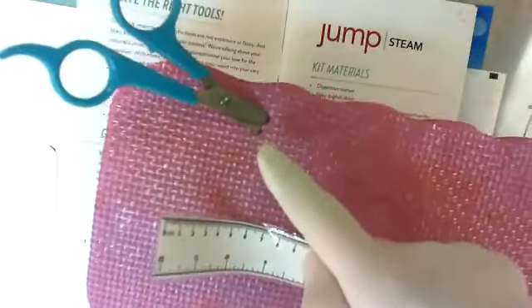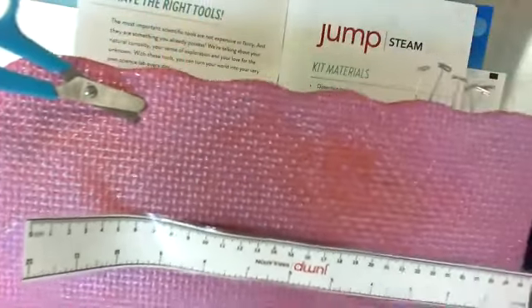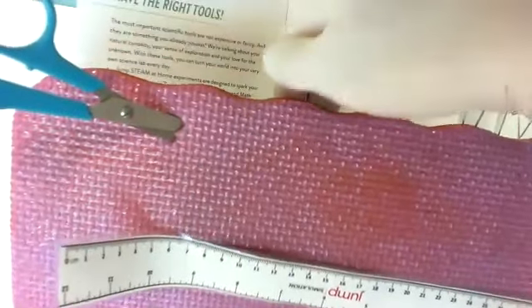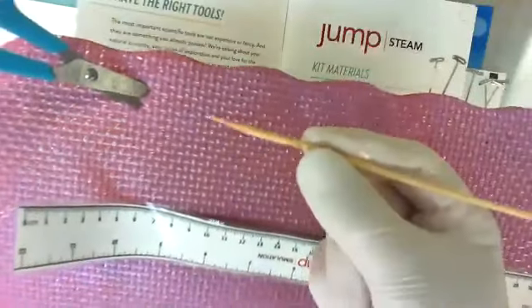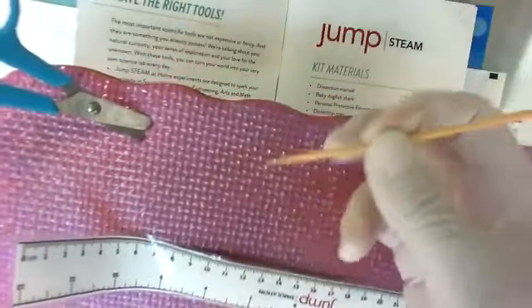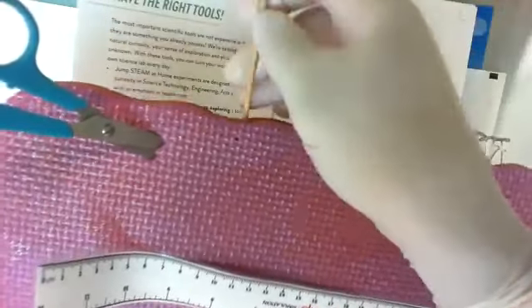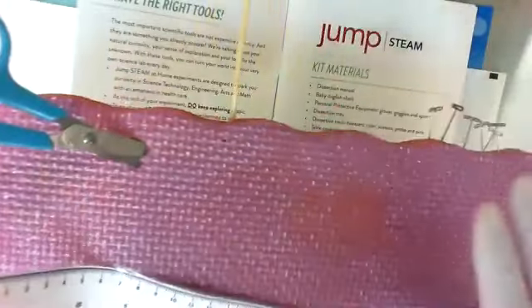You have a pair of scissors. You can see how I store my scissors, either in the top or I poke them down in. If you have the rounded scissors, which I prefer, I don't have any near me, you can still do the same thing, or you can just slide them underneath the mat just so that it's protected. And then you have a probe. It's like this. Yours is shorter, but it's thicker and it's better than mine. Sharp tip here has a flat edge on the other side, but you can either stick it into the cushion or into the top, however. This one I have breaks way too easy, so I'm jealous of the ones you have. Those are your sharps. Always know where they are.